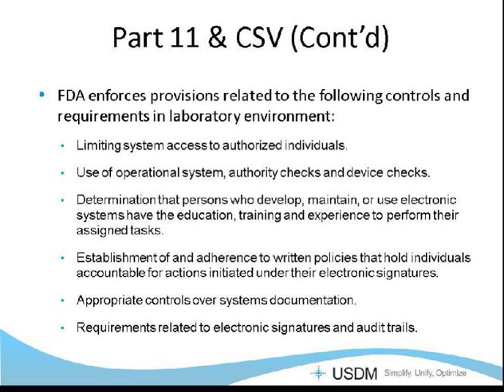They may have one computer system that is controlling multiple instruments. And so they're using one login because when the screen logs out, you need the person who originally logged in to start that equipment. And that doesn't comply with Part 11. So there have to be procedural controls and some updates to how we, in a laboratory, enforce these logins.